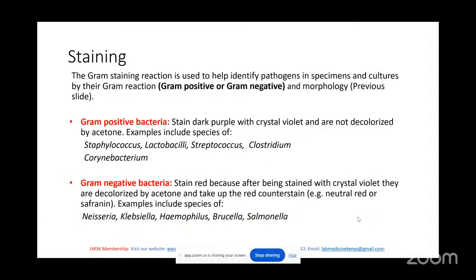Then we can also classify the bacteria in terms of their staining properties. The major staining property that we'll check for this particular PPT is the gram stain.